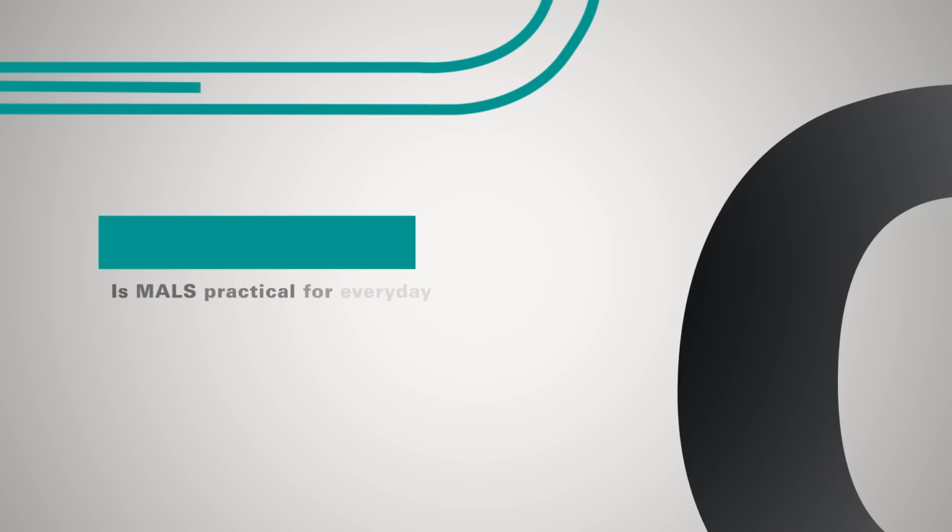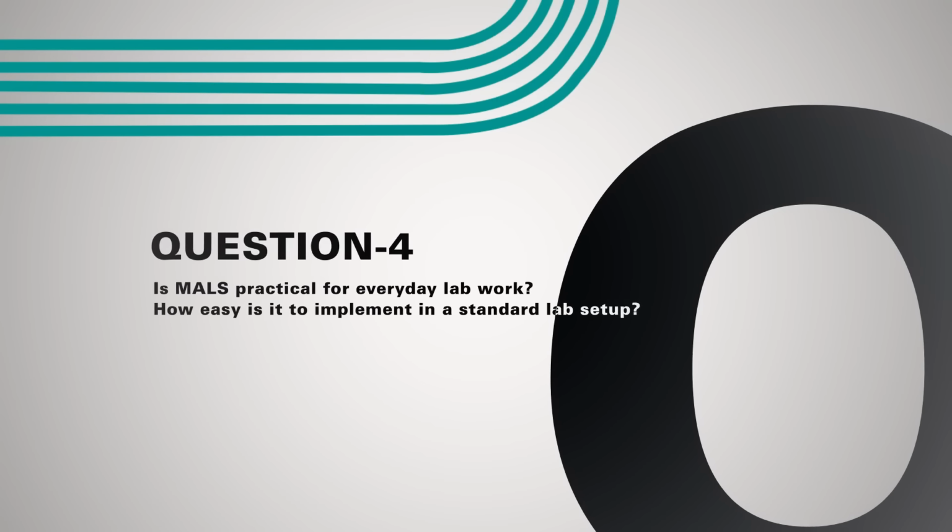So if we go through that, using the multi-angle light scattering detector, how easy is it to implement in any lab setting? Yeah, it's actually pretty simple. It's pretty similar to SEC UV or SEC RI.